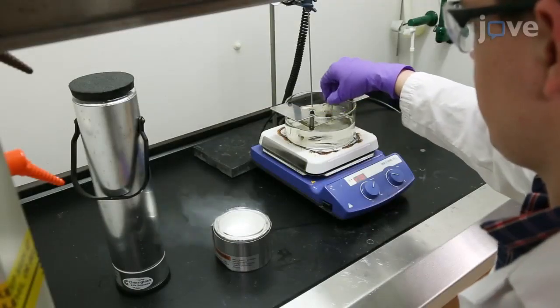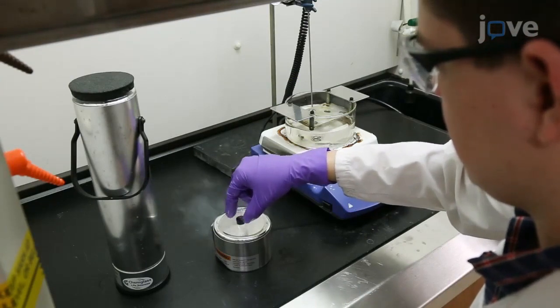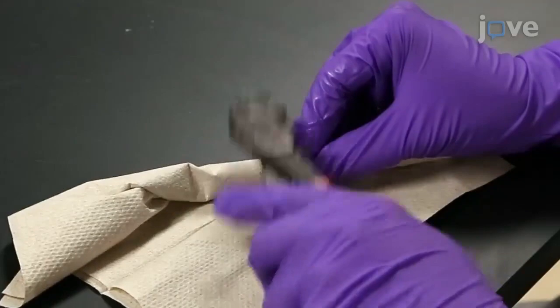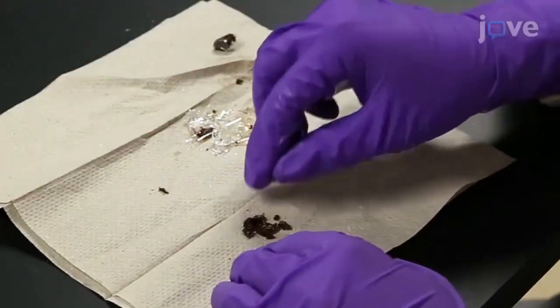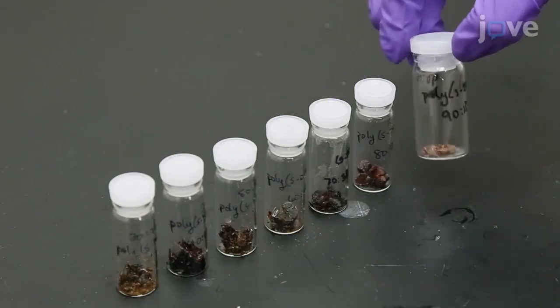After the reaction is complete, remove the vial from the oil bath and immediately quench by placing the vial in liquid nitrogen. Then break open the vial to remove the polymer, and repeat this step for each polymer prepared.